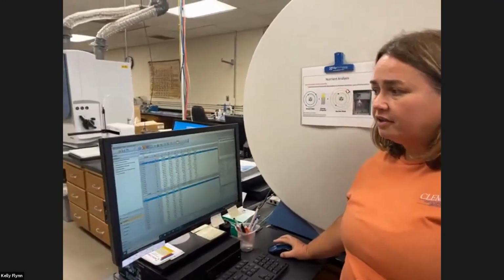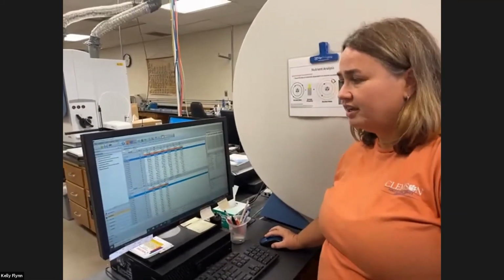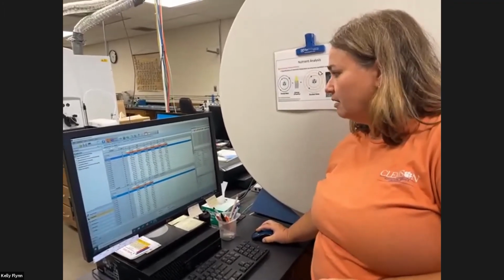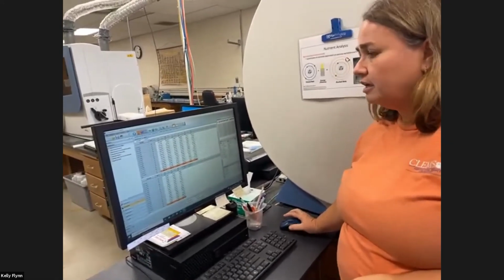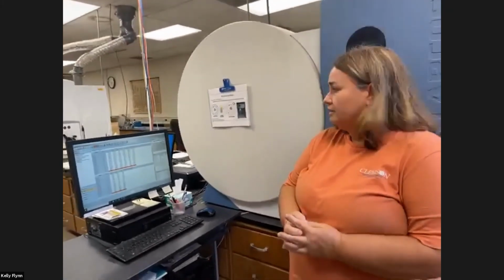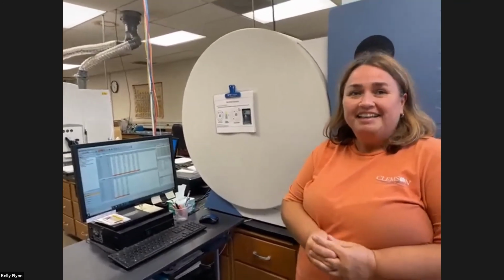We do have a lot of quality control mentioned earlier. We have checks that we analyze, and this green check here indicates these samples are within compliance for the checks. And we have those throughout the run. There's another set of green checks. So this is the data that we generate, and it's going to be on a laboratory report with recommendations. So that's a real fast look at the ICP.